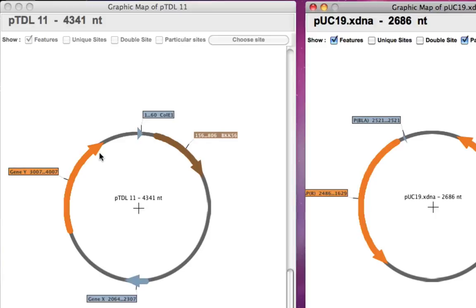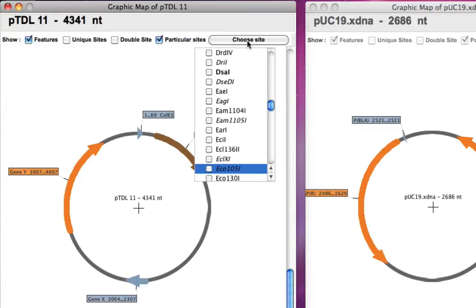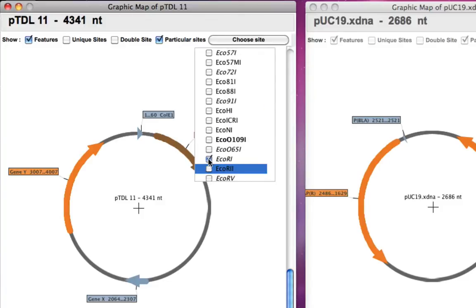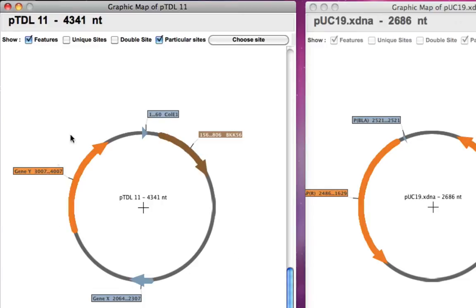But what if gene Y has an inherent BAMH1 or ECO R1 site? That would spoil the entire strategy. So first we have to make sure that gene Y doesn't have one of those enzyme sites. We'll click on plasmid TDL11 and from particular sites choose ECO R1 and BAMH1 to see wherever these enzyme sites are present. We can't see any of them — that's good news. Gene Y doesn't have ECO R1 or BAMH1 sites, so we can successfully use these two enzymes as flanking regions.